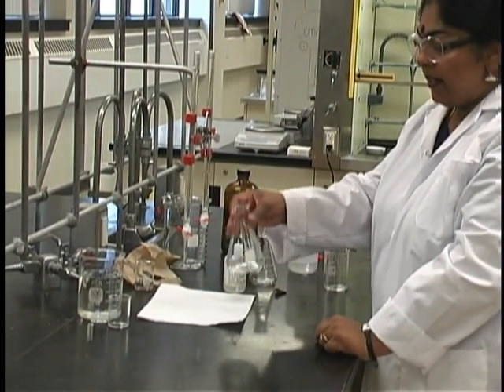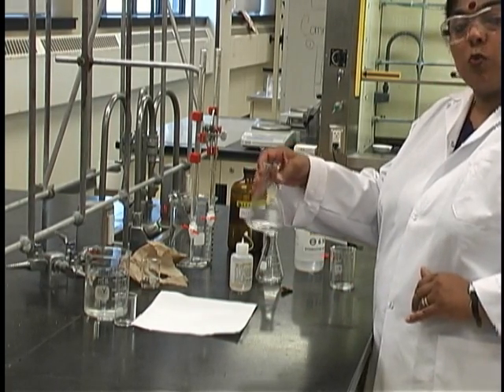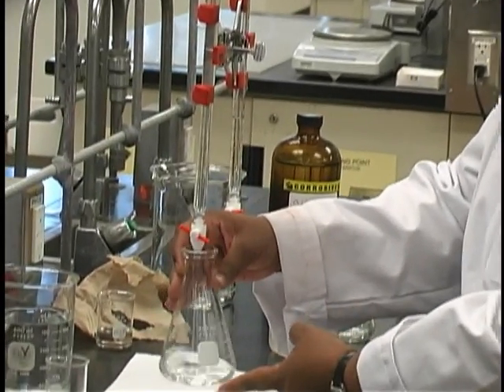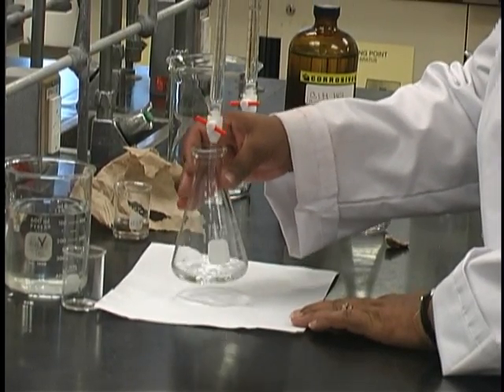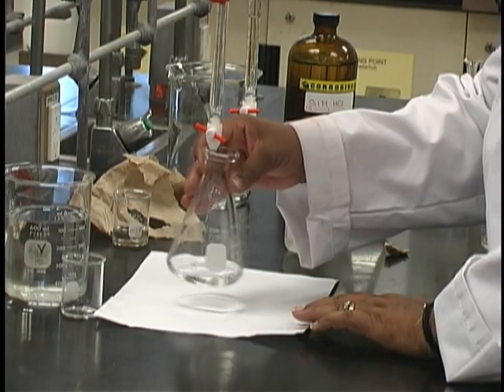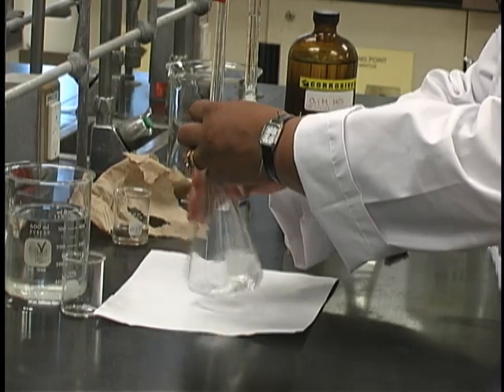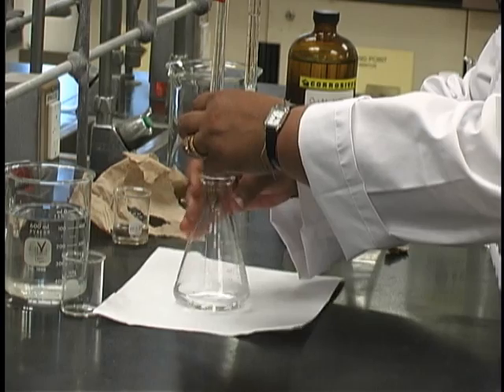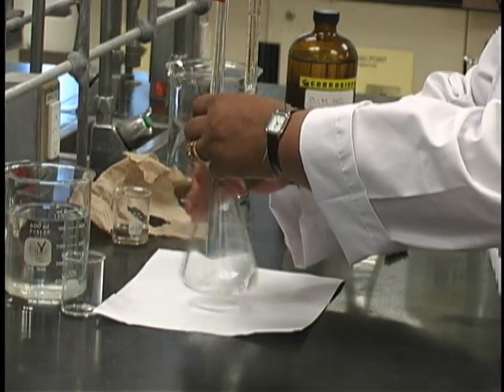You are now ready to begin the titration itself. The good technique for titration is to swirl constantly. For this purpose, you would like to have the flask well above the surface of the bench in order not to bang and break the flask. As you are swirling, you may start with a strong flow of the base. At this point, you will notice that there is no color change at all, and so you may add the base quite rapidly.